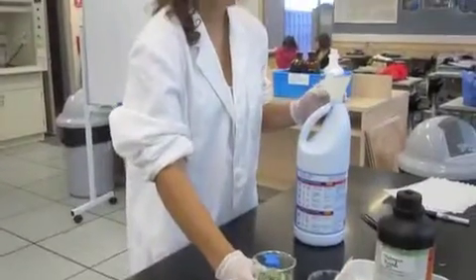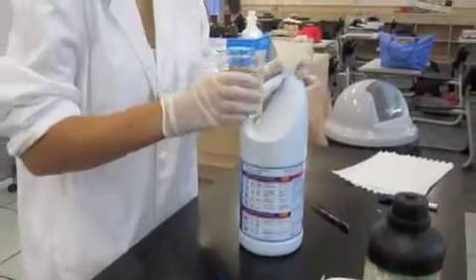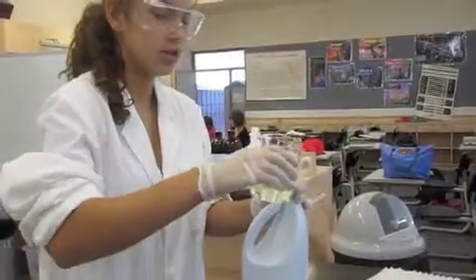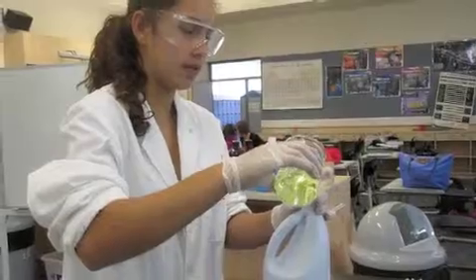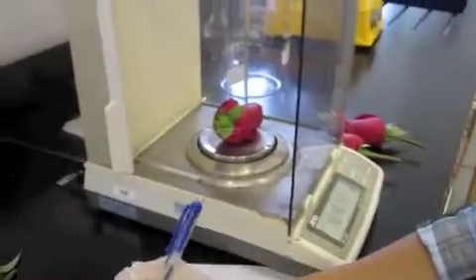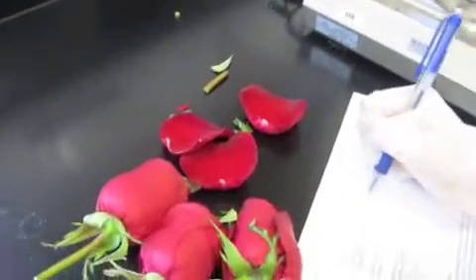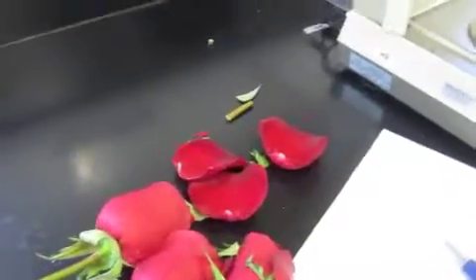Okay, so we've decided to reduce the amount of bleach that we use to 150 milliliters because we don't have enough hydrogen peroxide. So we have to make sure that we have 150 milliliters of NaOCl before we continue. Okay, Heather is massing the roses and ensuring that all of them weigh the same mass. We've decided to take some petals off.